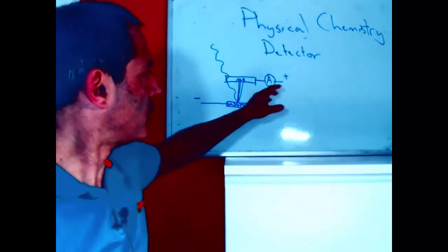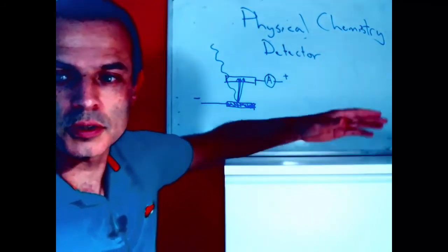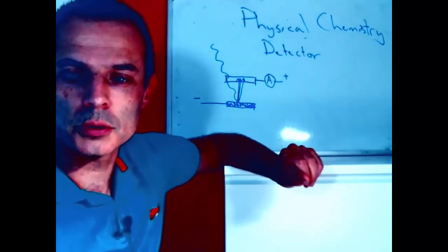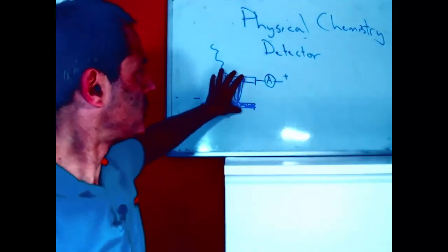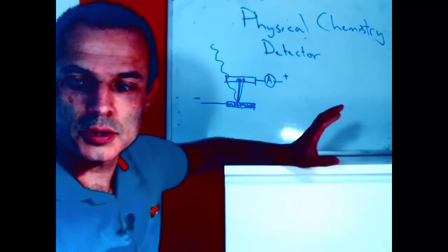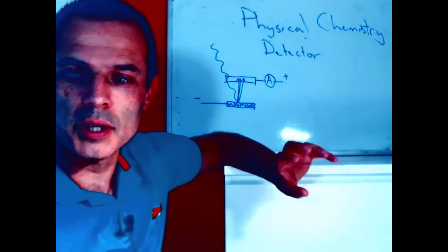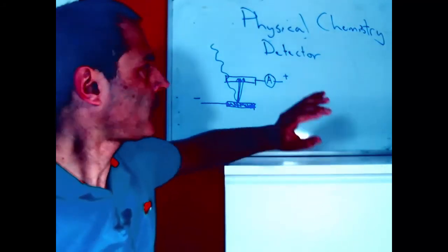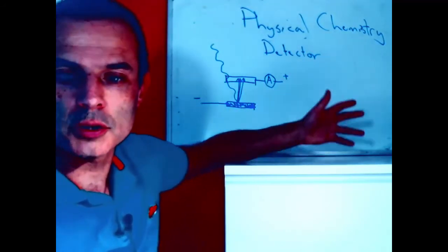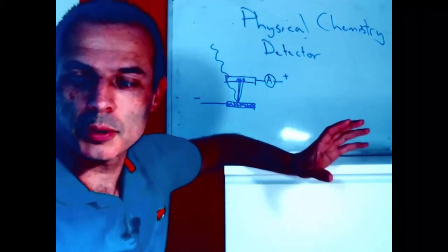There is a computer behind it which rejects apparent double events. So if it takes too long, then the second photon came in before the current from the first one was going out. So there is a limit to the physical size of these, and there's a limit to the speed that they can count at. It makes it handy for electron microscopy because not very many X-rays come out. These are comparatively cheap detectors because you only need one detector and you can measure all energies, although the steps are determined by the height of this band gap.